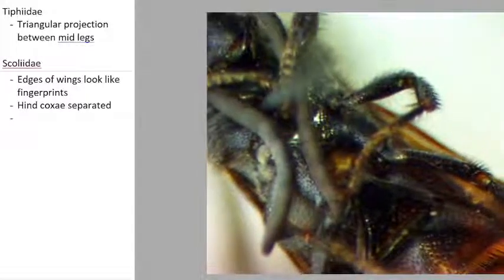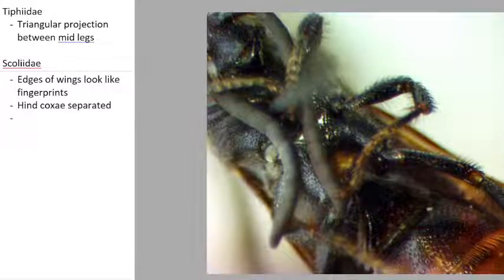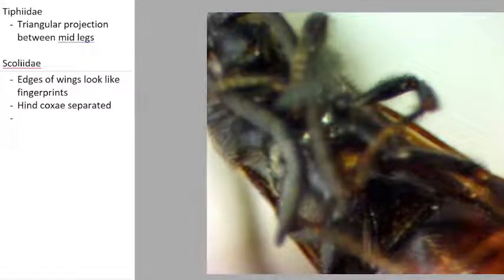Let's see if I can get this nice and focused. The legs and the antenna and everything are all kind of down there in the way, huh?